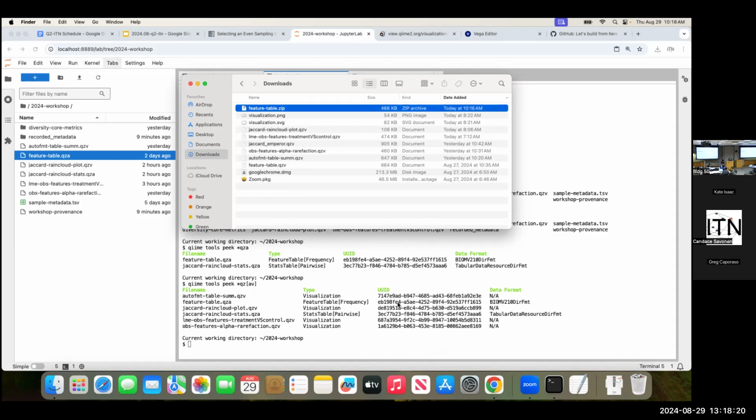Basically, what it's doing when it creates one of these is choosing a random number in the range between 0 and some massive, massive number. And I think the odds of having two of these get generated the same is something like equivalent to picking the same hydrogen atom out of all the atoms in the universe twice in a row, or something on that scale. So it's not guaranteed, but it's effectively guaranteed that you will never have one with the same result.